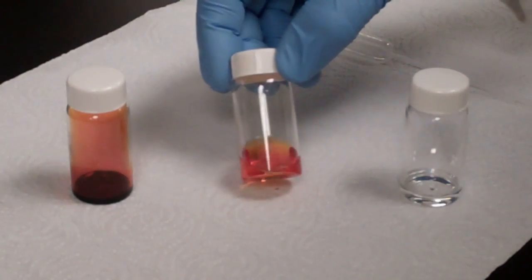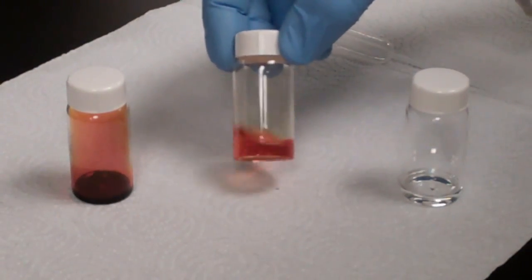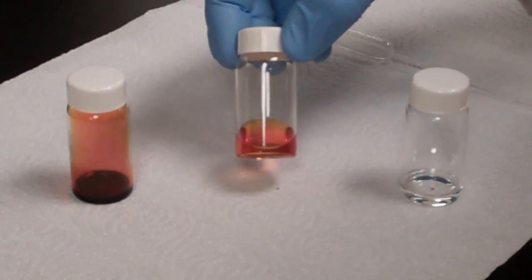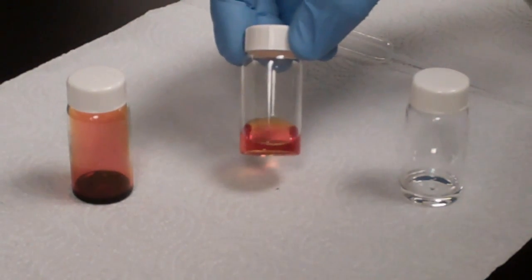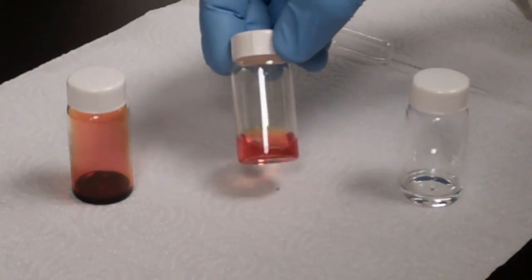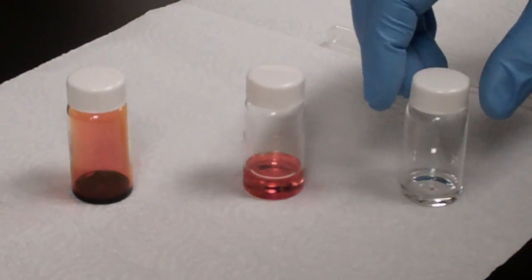This is a solution of 1 drop of bromine in about 5 milliliters of methylene chloride. You can see that it's much lighter. You can actually see through it. However, it does still look kind of reddish brown, and I think it looks like a concentrated tea kind of appearance. Nonetheless it is that reddish brown color, but it is transparent. You can see through it.